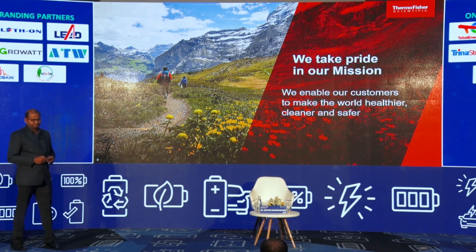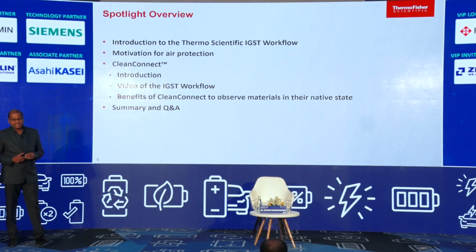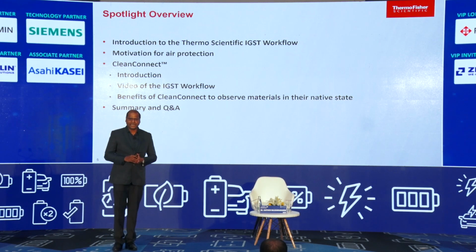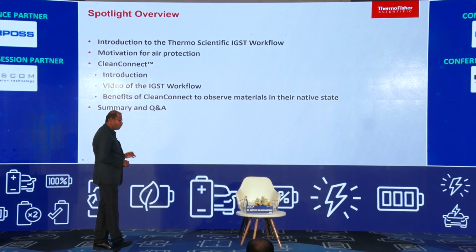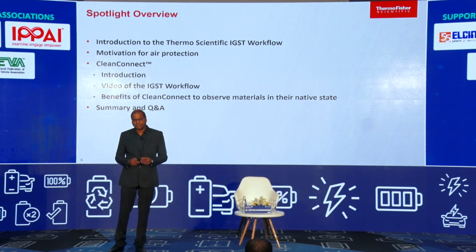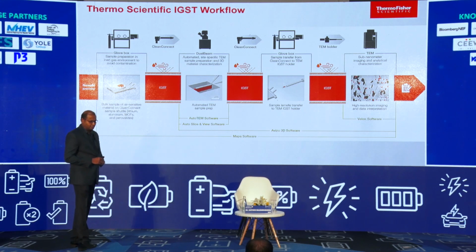Over this discussion, I will give a brief introduction to the Thermo Fisher Scientific IGST workflow. I will also talk about the need for native air protection and what kind of solution we have with our workflow. Finally, I will show you a video of how we use CleanConnect to research materials in a native state. That's an overview of the workflow solution that we would like to present.